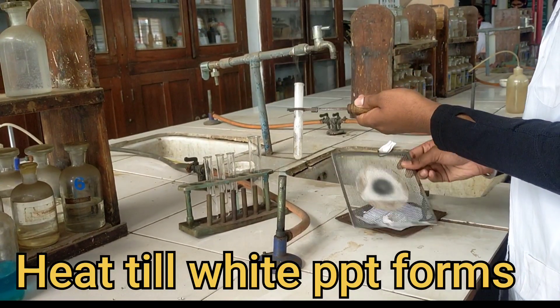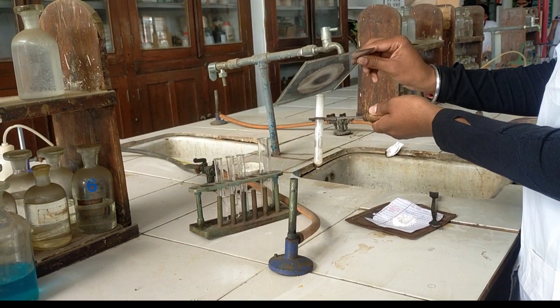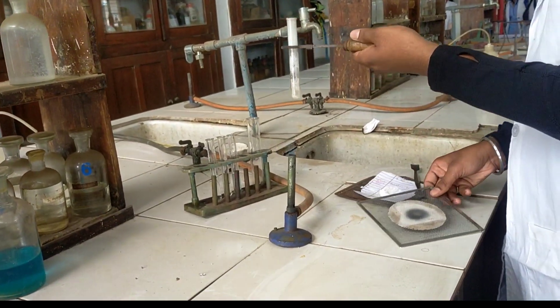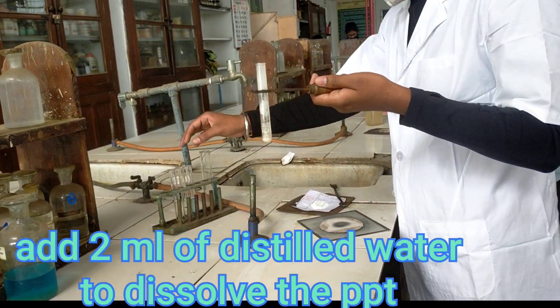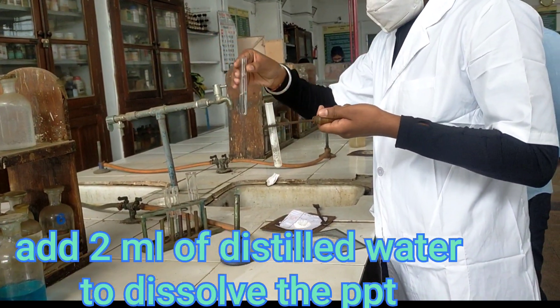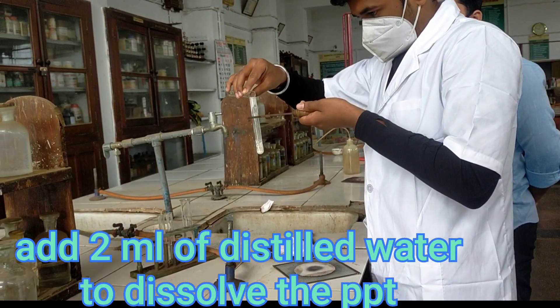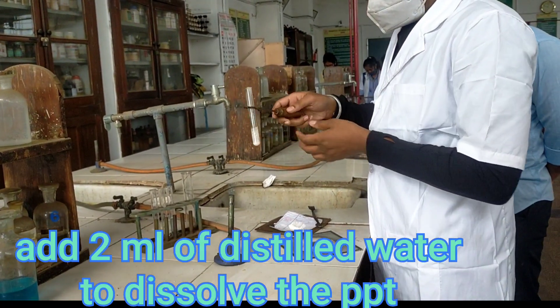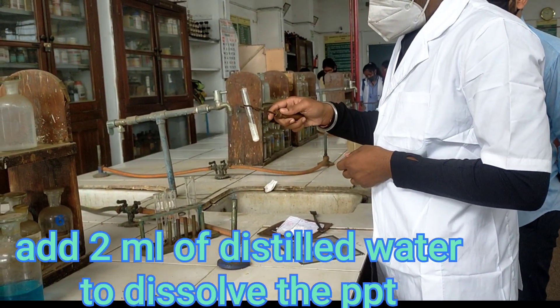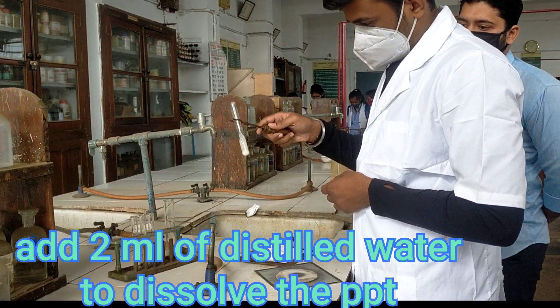Heating this compound till a white PPT is formed. With safety precautions, always use the wire gauze while heating. Now add 2 ml of distilled water to dissolve this PPT. Shake it so that the white PPT gets completely dissolved.